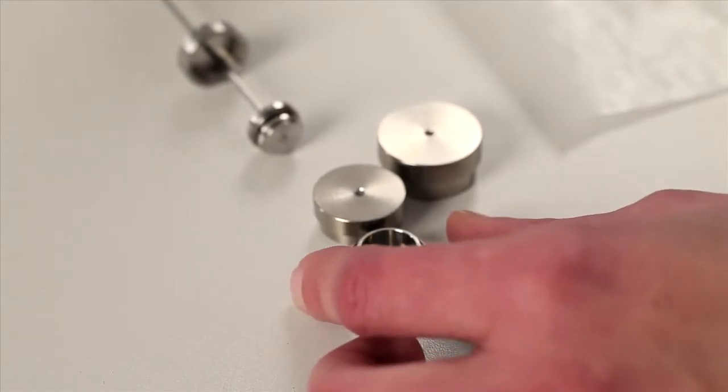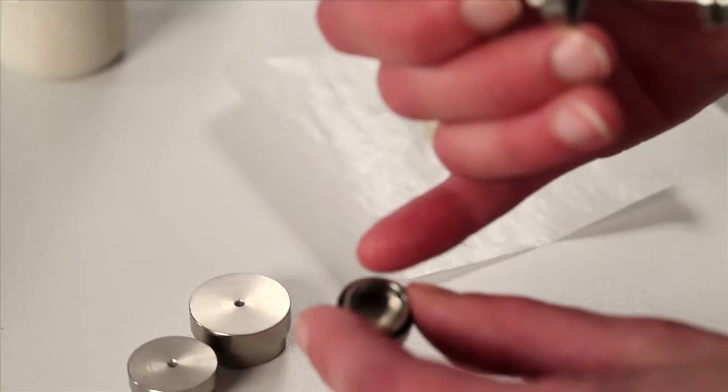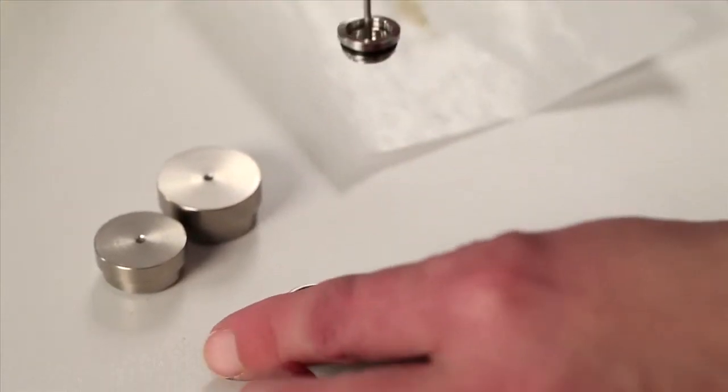Now, I'll show you how to load a batch ampule. This is a batch ampule that's been taken apart. Here's the outer compartment, the larger compartment, and here's the small inner compartment.